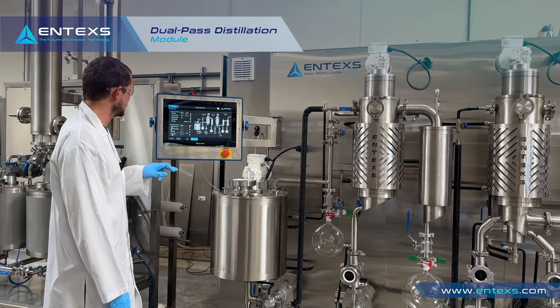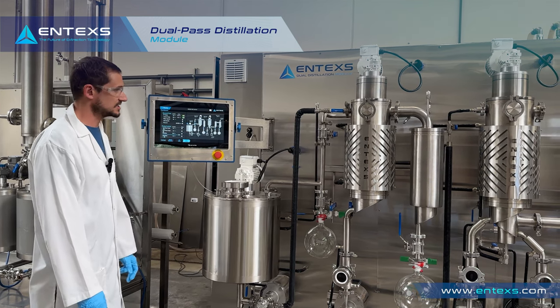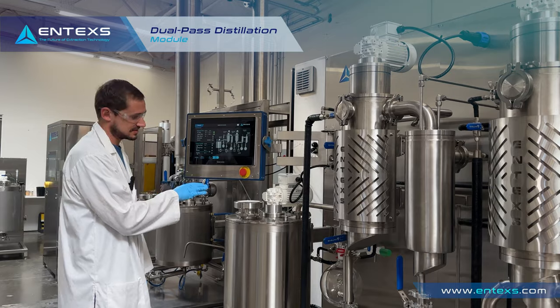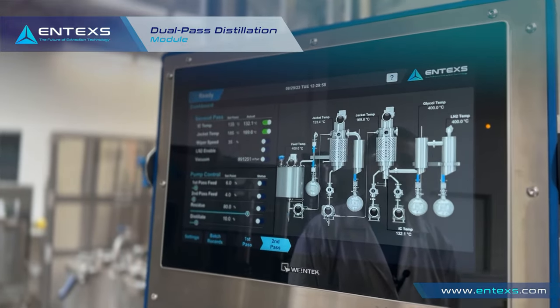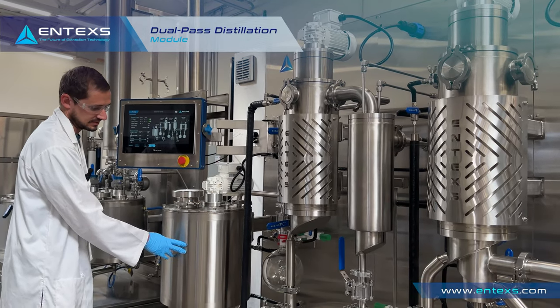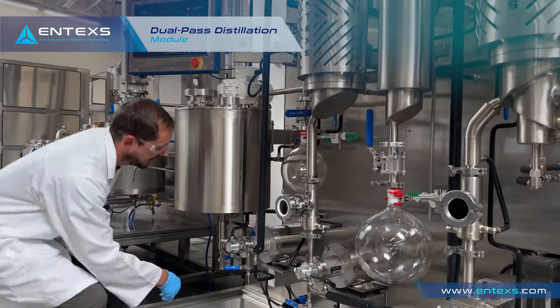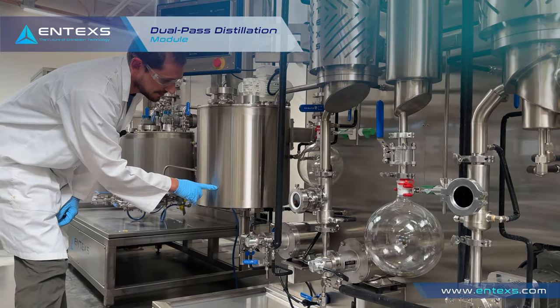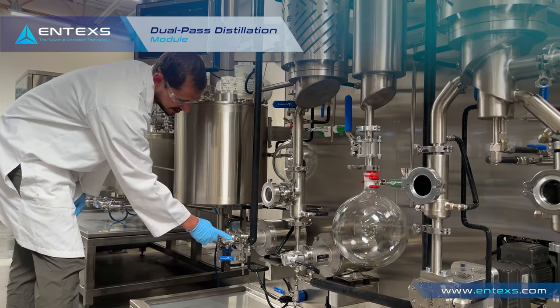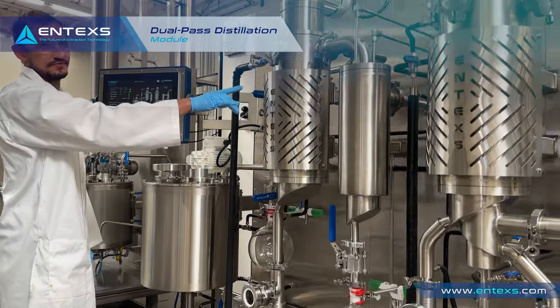To start up the second pass we also turn on the temperatures and let those reach their desired set points. In our startup process we've started heating up the jacket to warm up our crude oil to get it viscous enough to pump through the pump. The jacket temperature also controls the jacketed lines and jacketed pump head so it can easily pump and flow into our first wiped film.